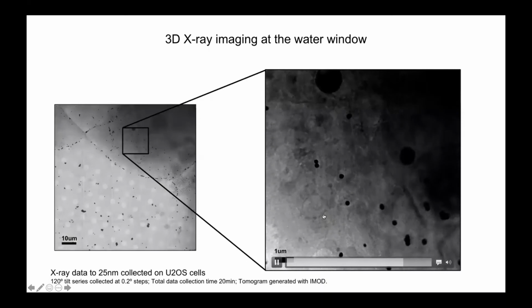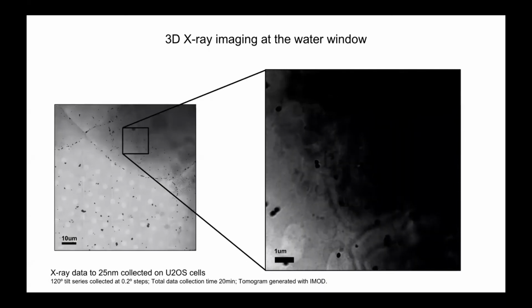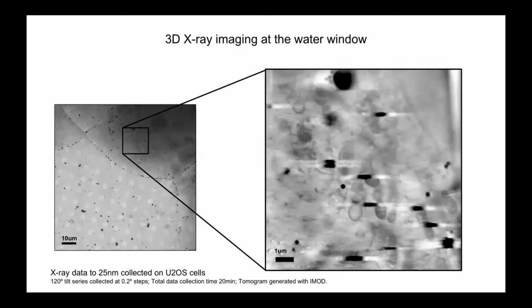Of course, it's already pretty impressive, and to some extent, the data collection can be quite quick. The exposures, for example, were only a few seconds each. I'm lying, that was 1 second each. So you can imagine if we're collecting 120, 240, maybe 600 images, going through that could be 5 minutes to maybe 20 minutes, but no more per tomogram, per package of data.